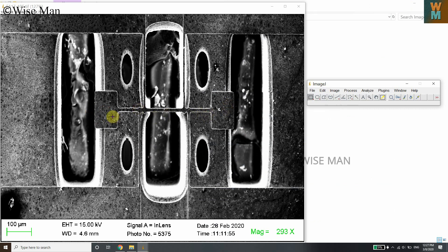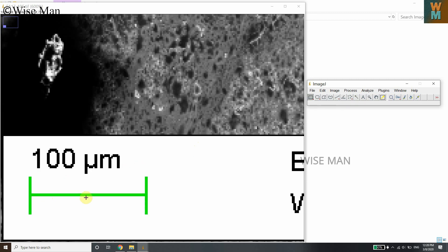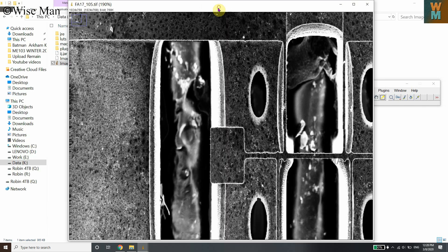Now I want to measure the distances of this micro electro-mechanical system. First, we need to understand that ImageJ works on pixels — it measures distances based on pixel numbers. As you can see, there's a scale bar on the image: in this number of pixels, we have 100 micrometers. If you zoom in, you can see the square pixel blocks.